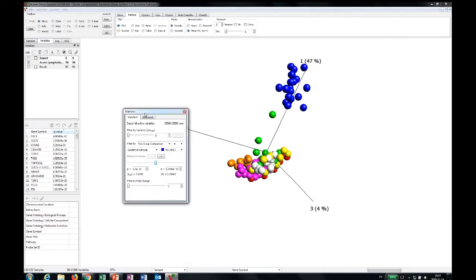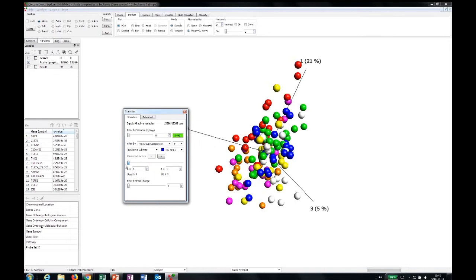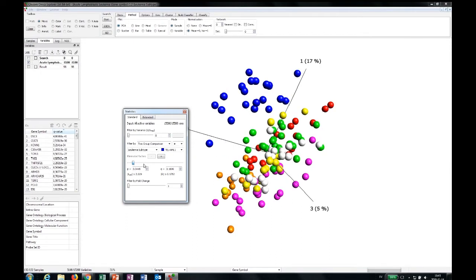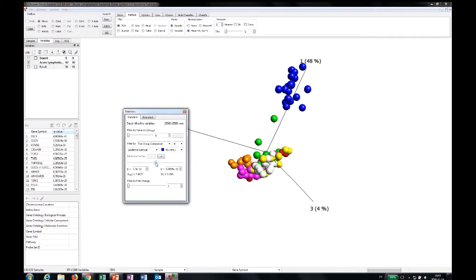So if I would have done this the way we would do it, instead of starting with a table, you would actually just have done like this, and you get your same 98 genes if I hit the same settings. But all the time when you have done the statistical filtering, the results and the fact that the one green sample here is very close to the blue one, and maybe need some extra attention to find out why it seems to be very close or very similar to the TEL-AML1 samples.